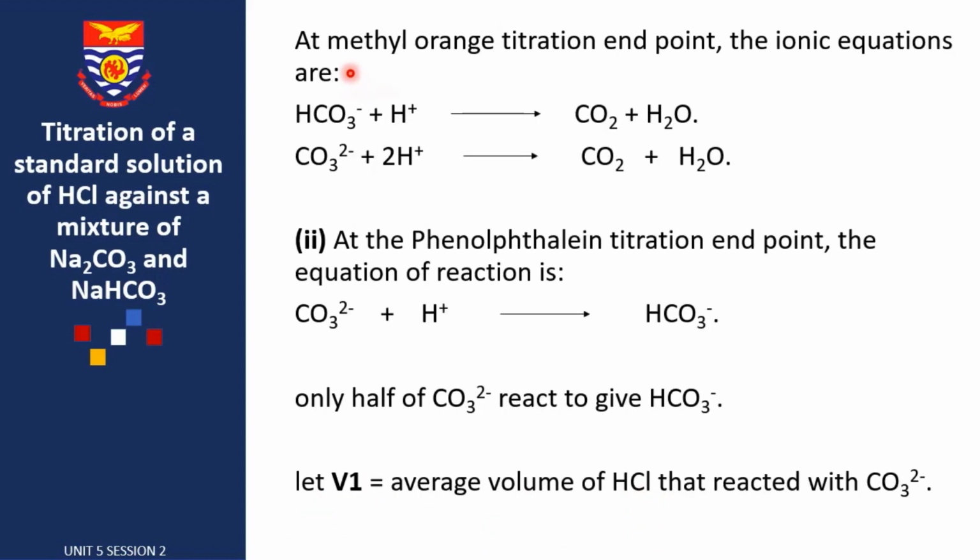At the methyl orange endpoint, because this time around we didn't use the resultant solution, we have fetched another new solution, and in the new solution we still have the original carbonate ion and the bicarbonate ion. They are all present.